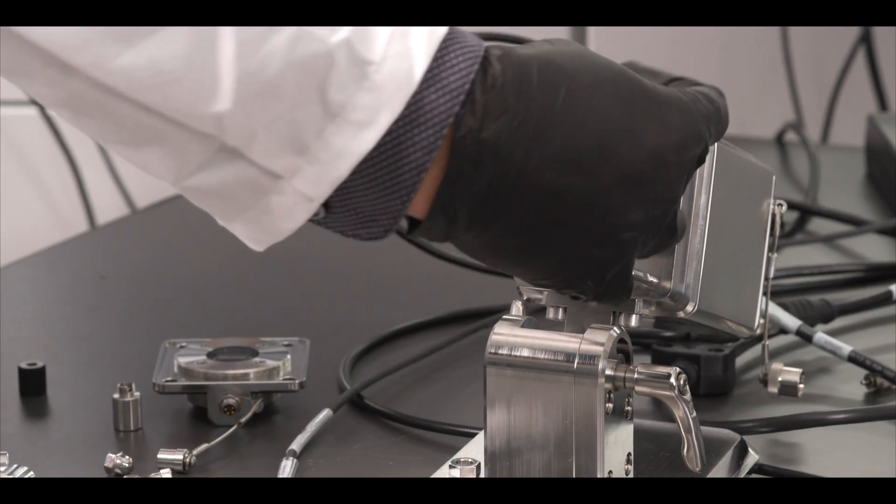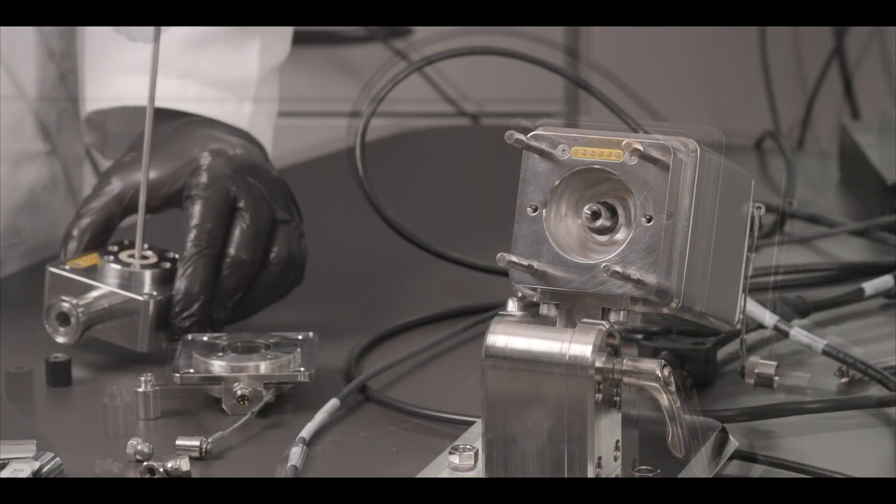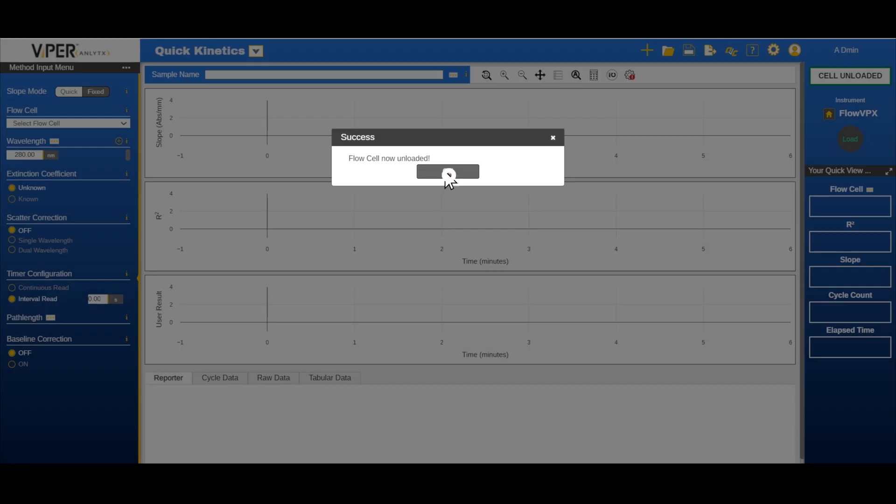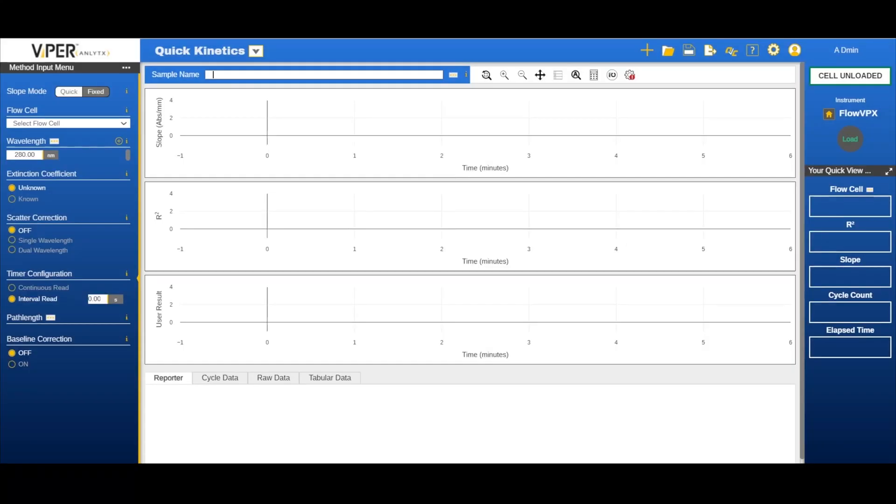Remove and discard the two disposable gaskets. Click OK in the software to complete the process. Congratulations, you've now finished unloading the flow cell.